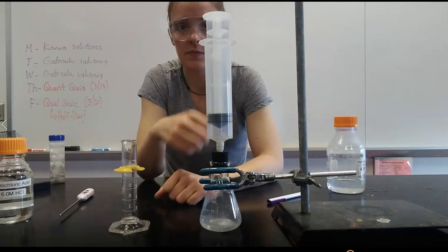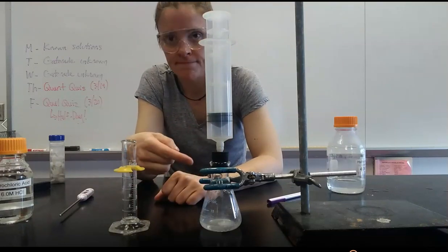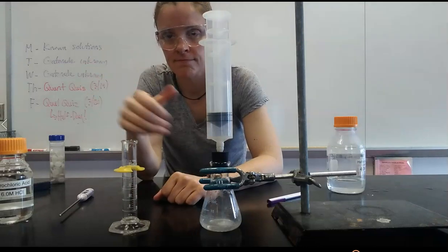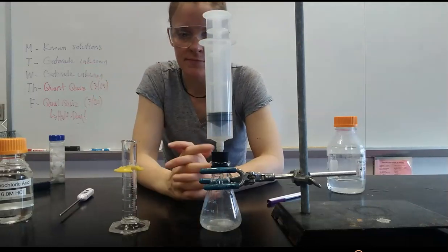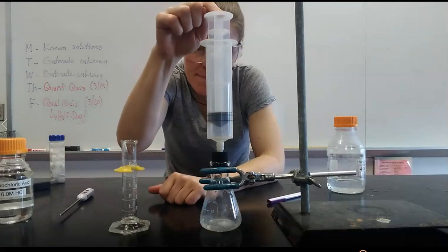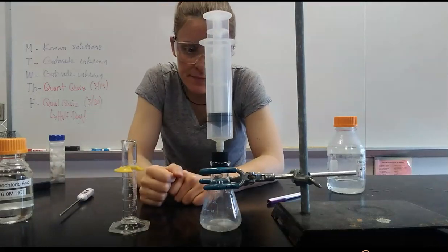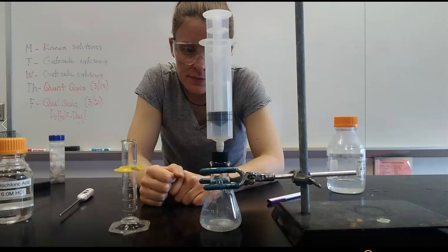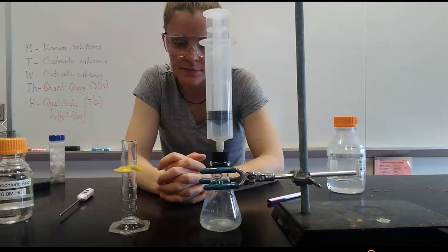Every 10 seconds press down. The pressure of the gas should cause, I should say the volume of the gas is going to expand. You're going to let that go for about five minutes and then cut it off unless it reaches its end point sooner. You'll be able to calculate a theoretical yield for this so you'll have an idea of how much gas you should produce.